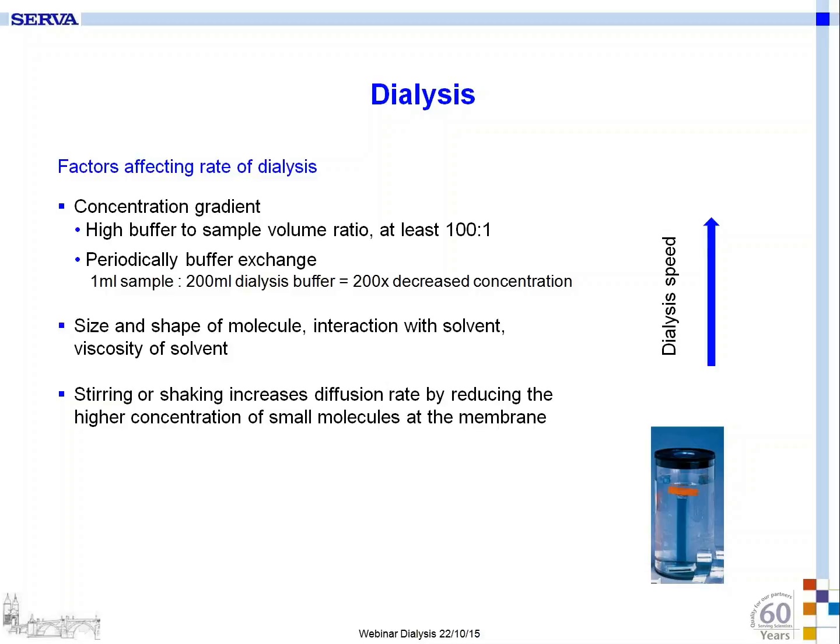So if you stir or shake, you break up this layer, and then you maintain the concentration differential you need to have a good diffusion rate.